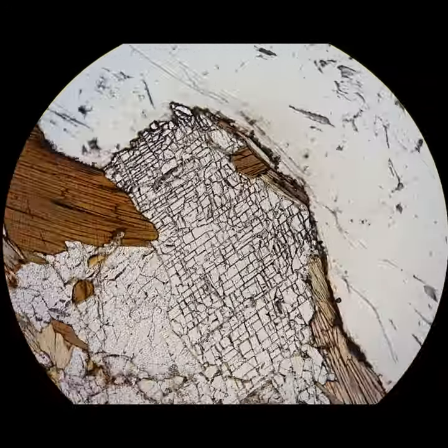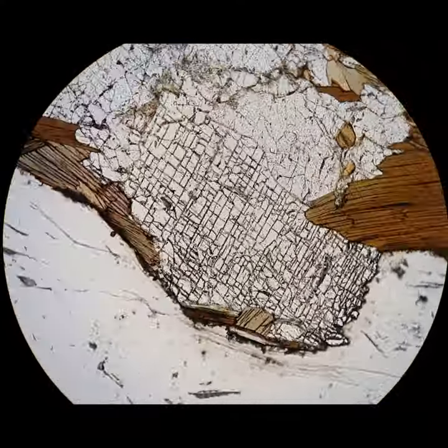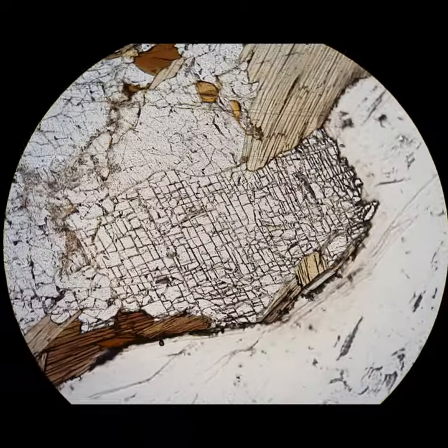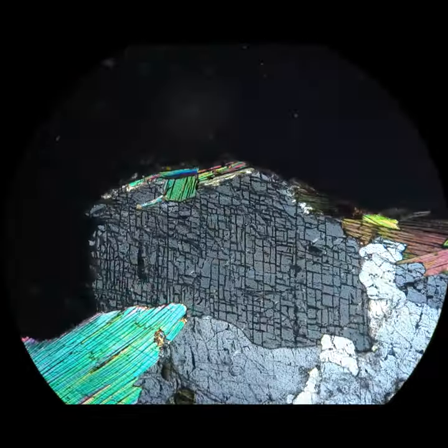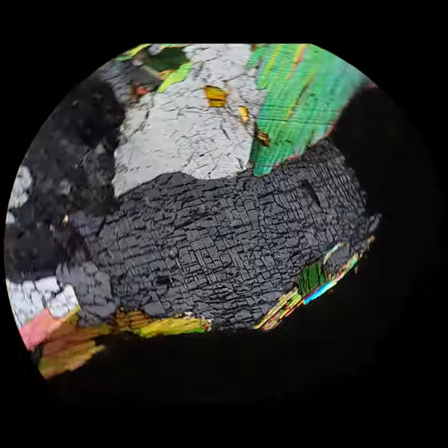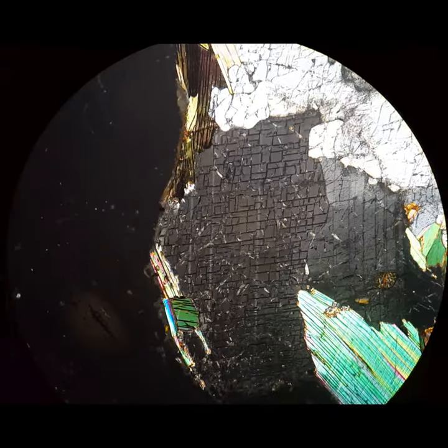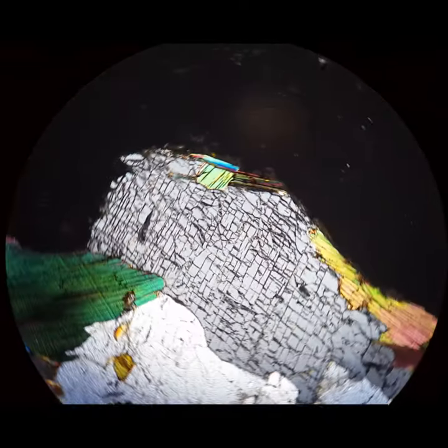Feldspars rarely show cleavage, but if you have a badly made thin section, then sometimes a couple of cleavages will show up. This is a feldspar grain in a not very well-made section — this is the edge of the section. That black all around it is epoxy, and you can see that there are two cleavages, two sets of parallel lines that intersect each other, and those are the cleavages of the feldspar.